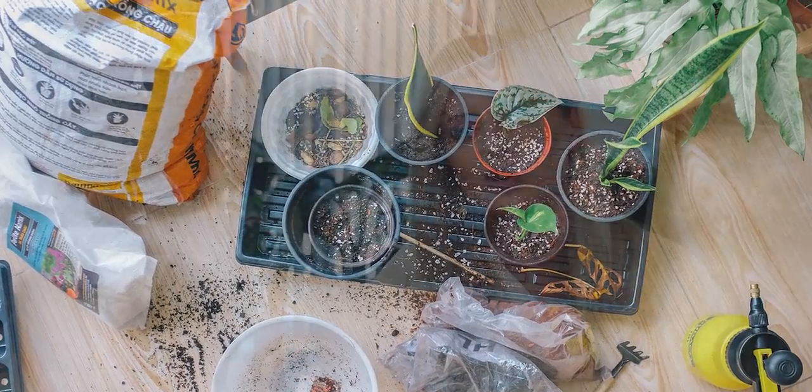If the protocol from tissue culture is successful, you can clone one plant into thousands very, very quickly, very easily, and in a very cost-effective manner. The methodology used to do this is usually a trade secret. For example, when I show you the demo in this video of myself performing tissue culture, I'm not going to divulge any of the recipes for the growth media needed to do this.